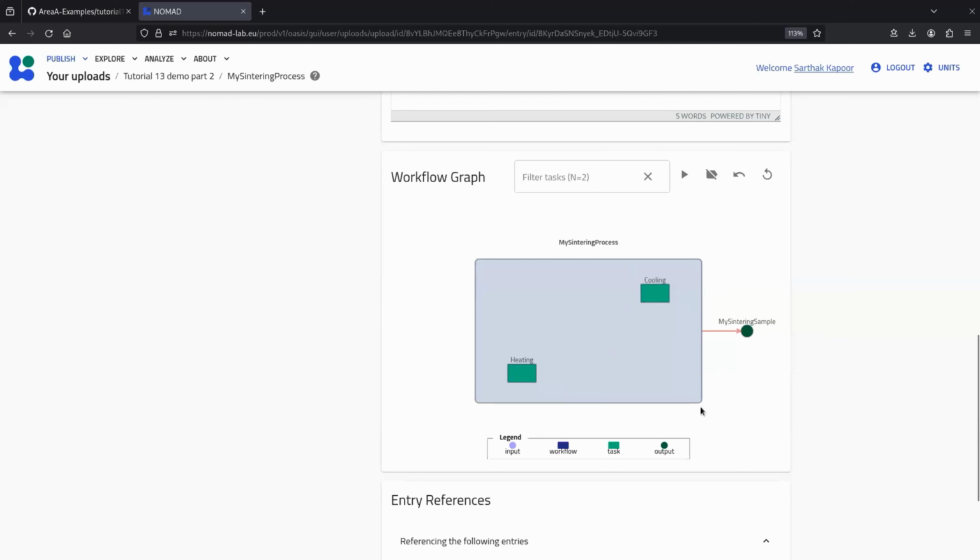Right now, it does not make a lot of sense because we are not really creating a sample, rather we are performing some action on that sample. So having this as an output is not very ideal. But this is, again, the base behavior of this class, and we can change this if we are writing our own plugins.